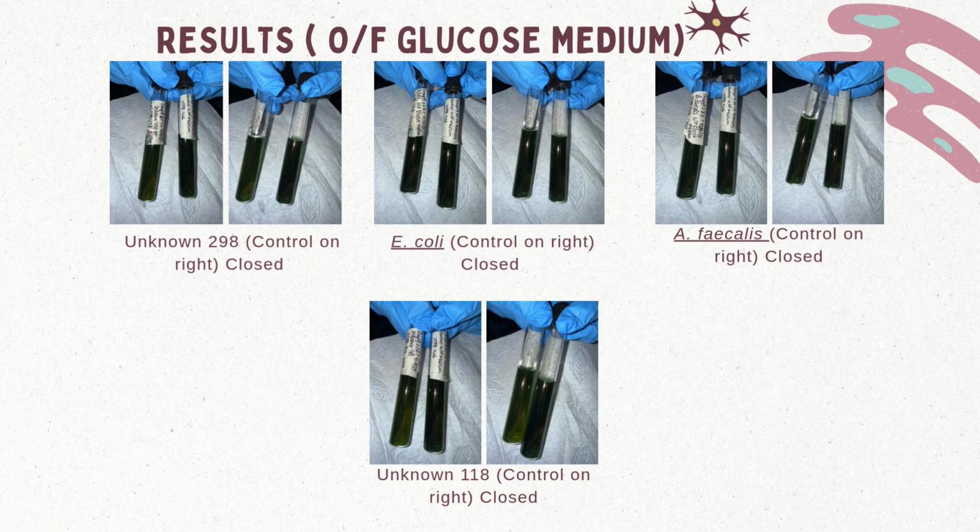So like I said, what does yellow in both OF tubes indicate, or what does no color change mean? For TSIA, we asked what yellow slant and yellow butt mean. That shows fermentation of glucose plus lactose or sucrose, and the black precipitate indicates hydrogen sulfide reacting with iron salts. And when we saw cracks or lifted agar, how does that cracking occur? It's due to the gas produced during fermentation.